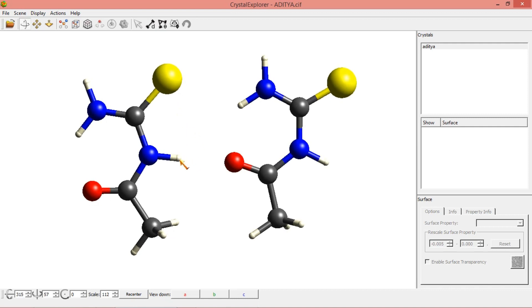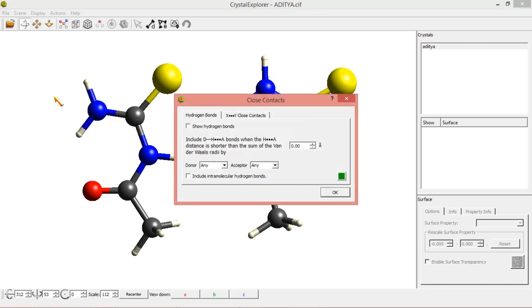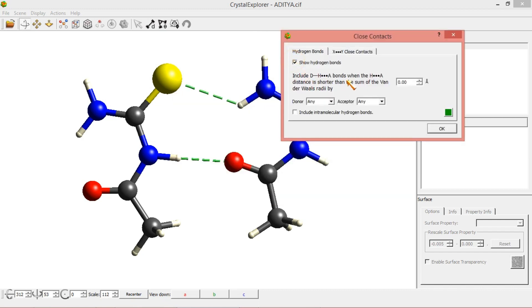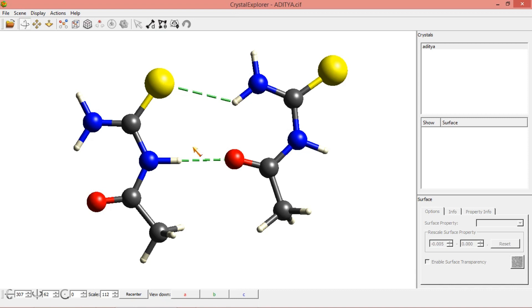Here I am going to show you inter and intramolecular hydrogen bonding interactions. Hydrogen bonding interaction means the interaction between hydrogen and another atom. Go to Display, then click on Hydrogen Bonds. After clicking, just click Show Hydrogen Bonds. I am also including intramolecular hydrogen bonds.